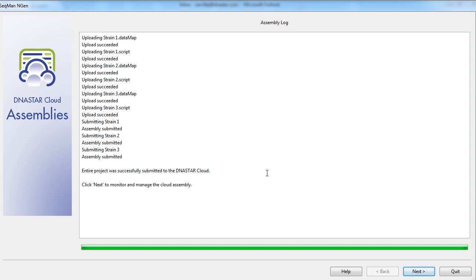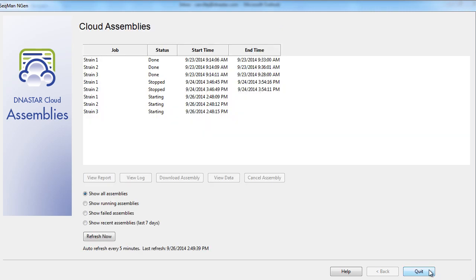Next, we'll want to monitor the progress of our assemblies, and we can do this in a couple different ways. After the assembly initially begins, we can click next and get to our monitoring screen.